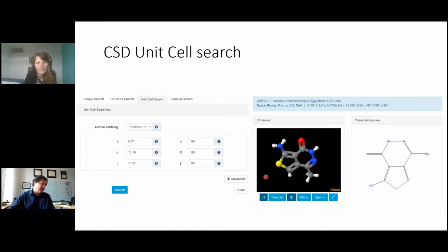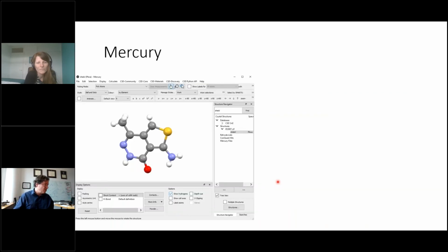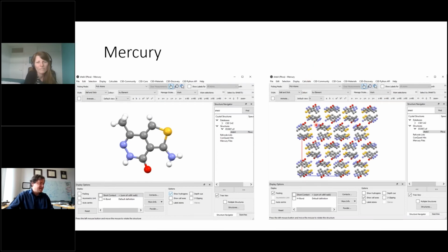And then this becomes an opportunity to teach them about searching the literature for CIFs of known structures. So we have them download the CIF. They can rotate it around, and now not only do they know what to do as a practical crystallographer, they know how to search the literature and use the CSD to search for structures. I teach them a little bit about the use of Mercury, which is a nice viewer, but what I really love about Mercury is it has some really cool utilities for viewing crystal packing and appreciating intermolecular contacts, which I have them do in this assignment.